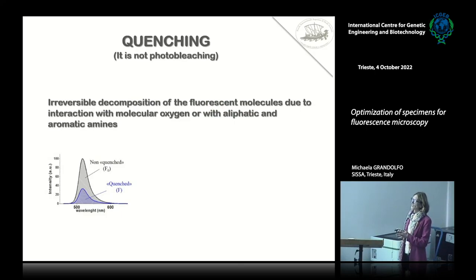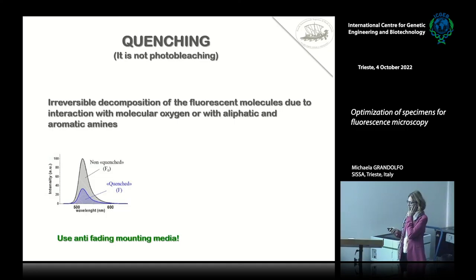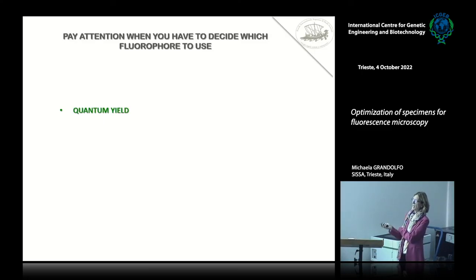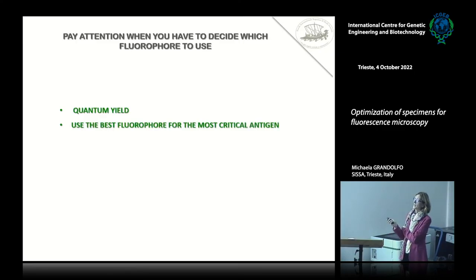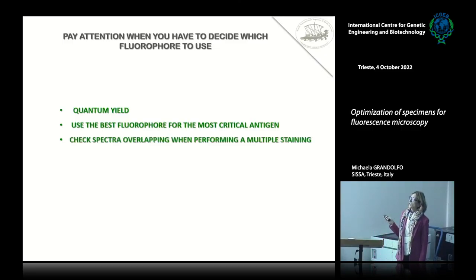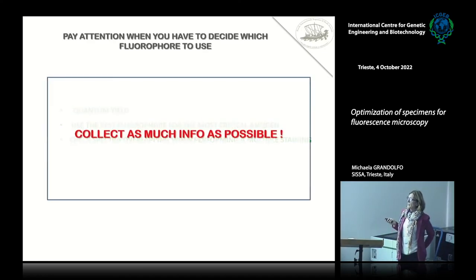Quenching is not photobleaching — it is the reaction of the fluorophore with molecular oxygen or aliphatic or aromatic amines, and you can fight it using anti-fading mounting media. Again: pay attention when choosing your fluorophore. Check the quantum yield, use the best fluorophore for the most critical antigen, take advantage of the fluorophore if your antigen is rare or your primary antibody is not working well, check spectral overlap when performing multiple staining, and in synthesis, collect as much information as possible.